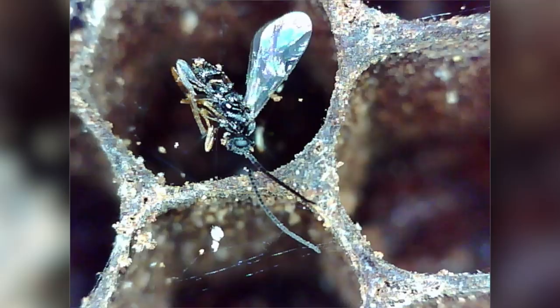Did you guys see what looked like a little bug? Look at this! That is not a bee — that's just another little fly that's probably been caught in the sticky wax or honey, or maybe even a spider's web. That is amazing.